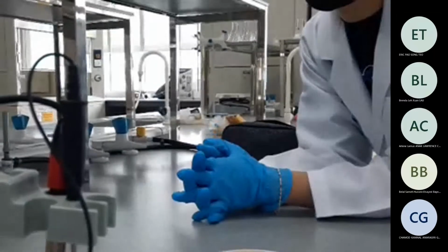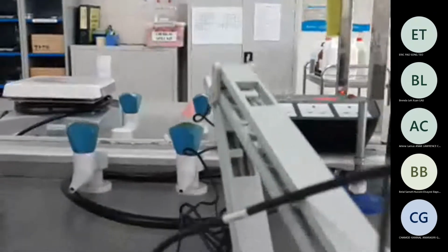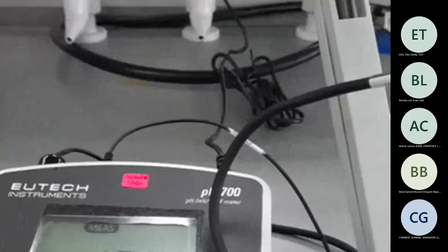Now I don't need to press anything, I can just leave both of these. Make sure that both the conductivity probe and the pH probe are inside the solution, dipped. After waiting maybe 10 seconds, the reading comes out.